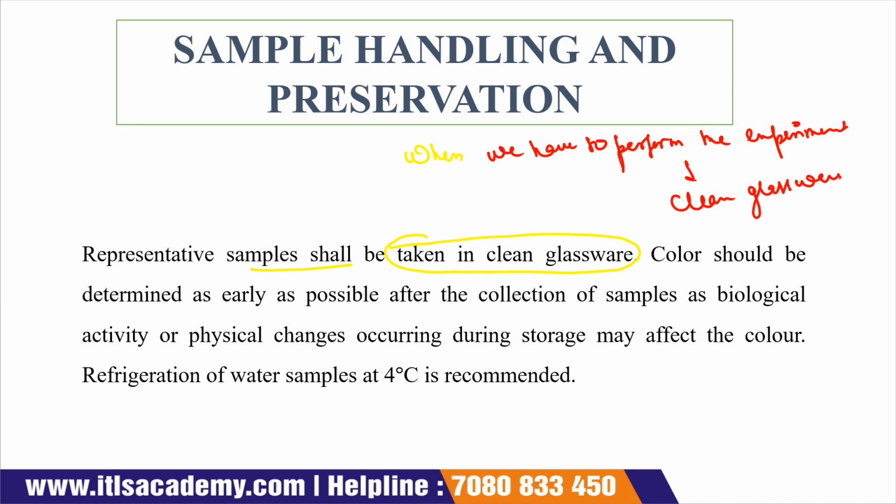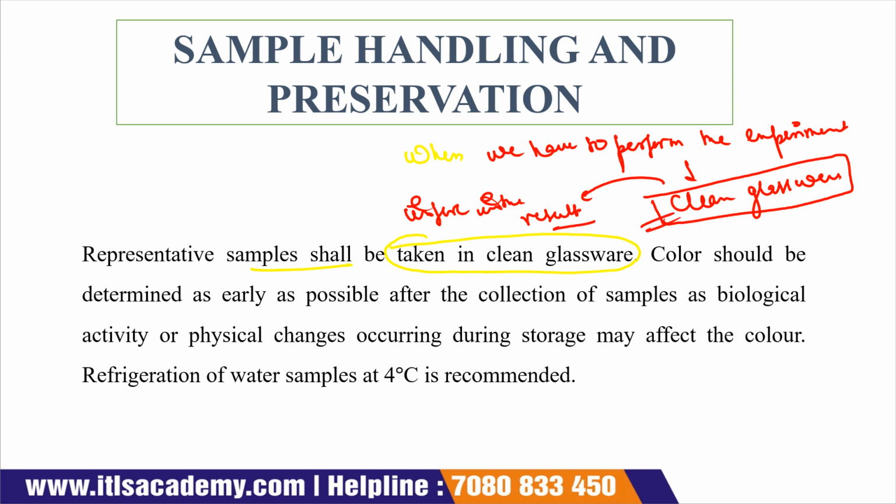There is a reason for taking clean glassware, because if the glassware is not clean, it will interfere in the result. That's why we have to take clean glass. Now, color should be determined as early as possible after the collection of the sample.